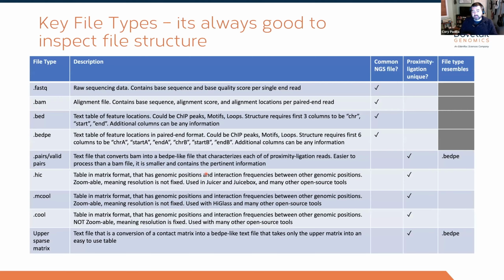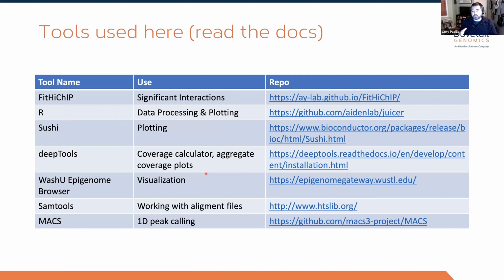Here are just some file definitions that you can look at the end on your own time, just what's common, what's proximity ligation unique. And here are all the tools that I've used in this workshop and the links to go get them.